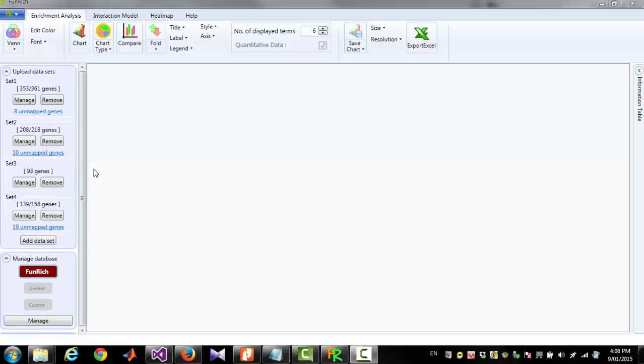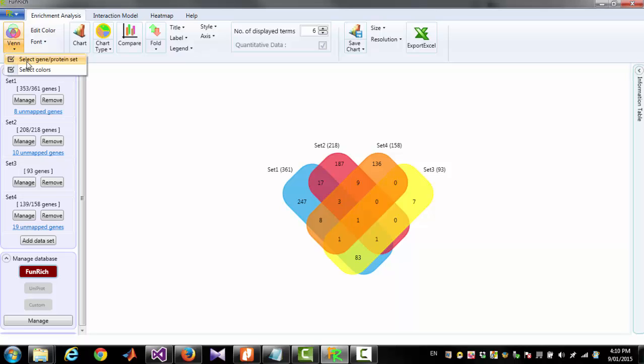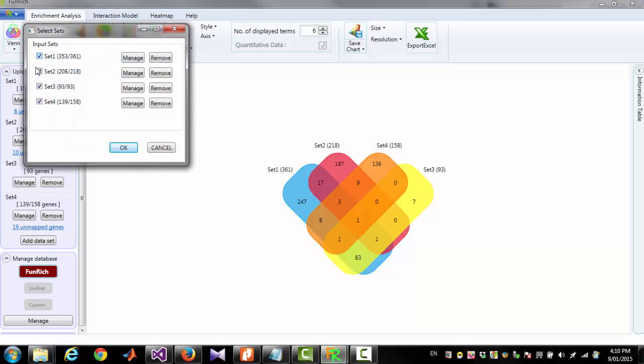To generate Venn Diagram for all the sets you have to click the button Venn. You can select which dataset will appear in the diagram and which will not by clicking the button Select GeneProtein Set.